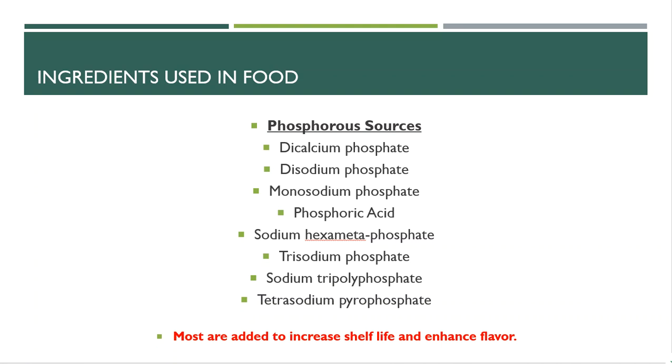And you're swinging it down. It's giving you that carbonation. It's giving you that caffeine. It tastes good. And it's healthy for you, right? It says Diet. Well, the issue here is that it also brings along phosphates. And many sodas do. And that's really what this lab is going to be focused on.